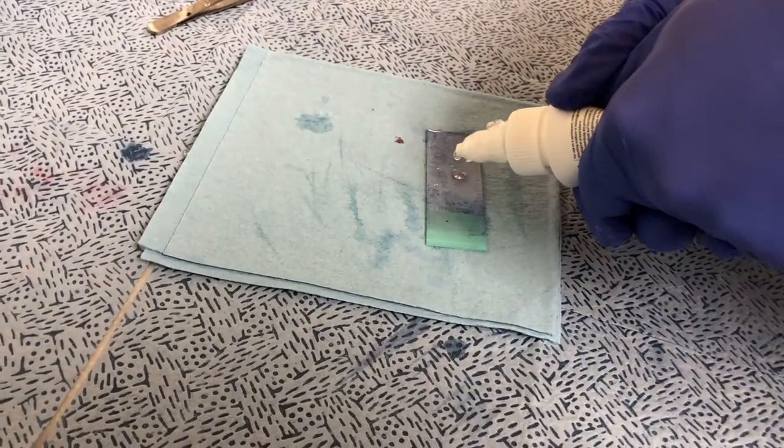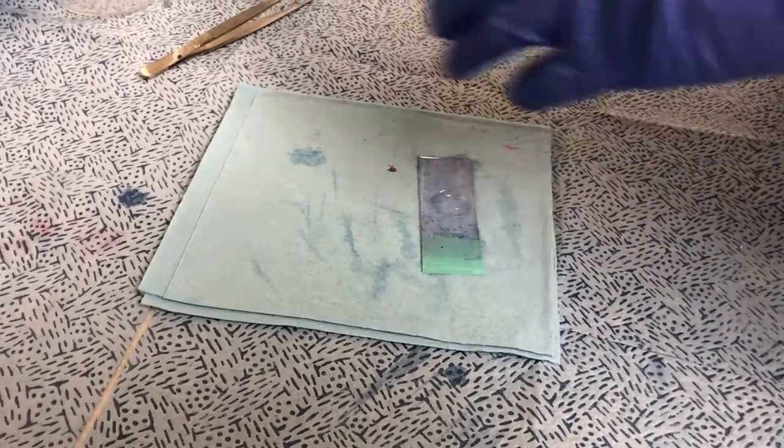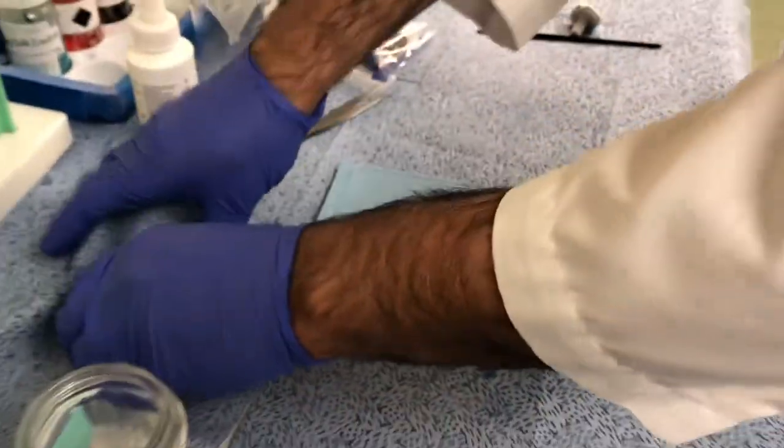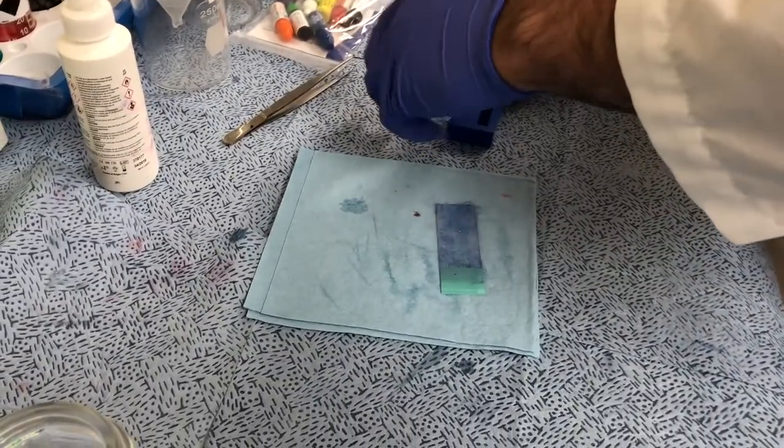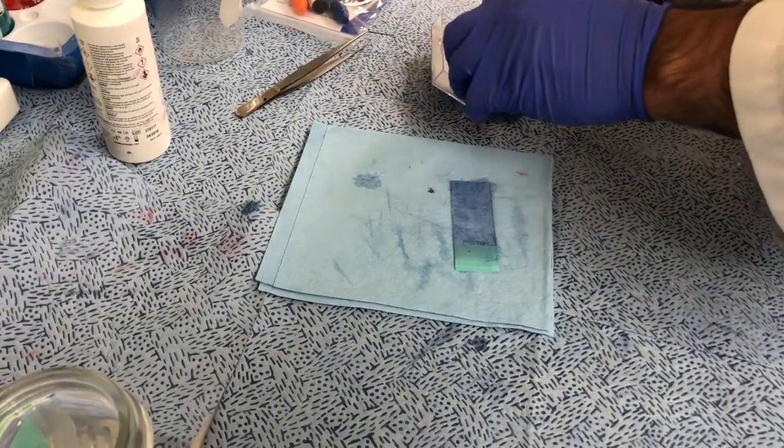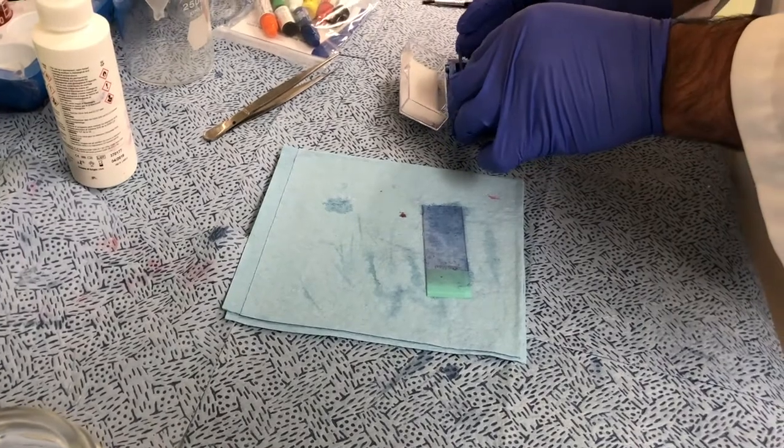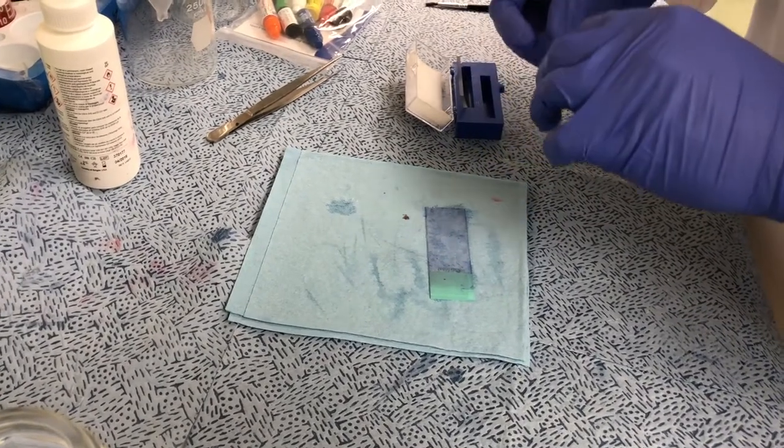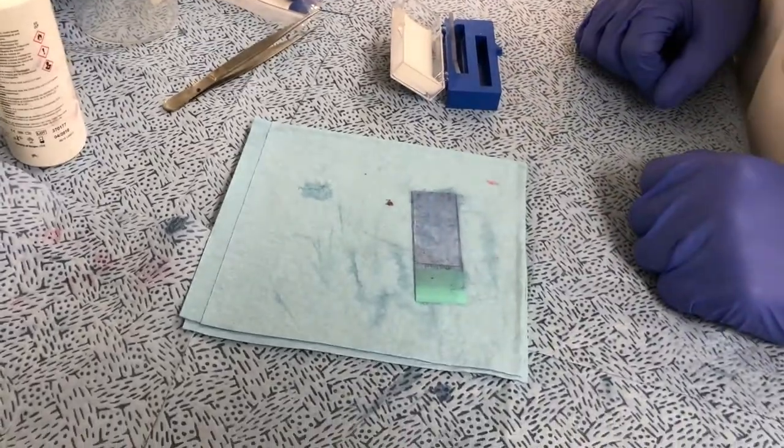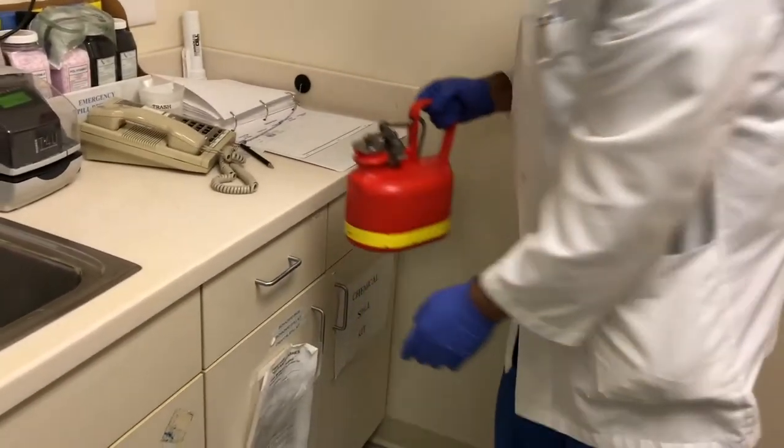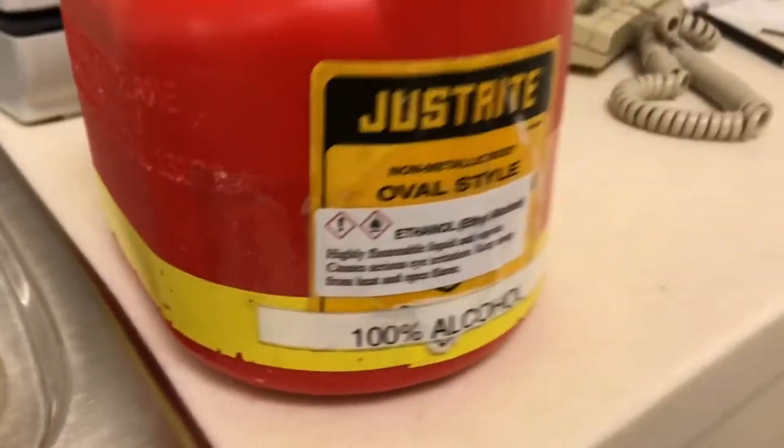Put a drop of oil on the slide and then put a coverslip over it. Clean the cryostat with the alcohol solution. Don't use water.